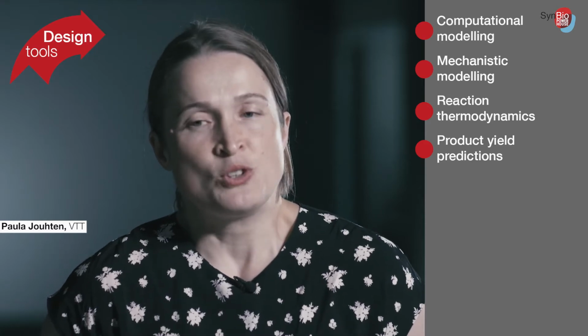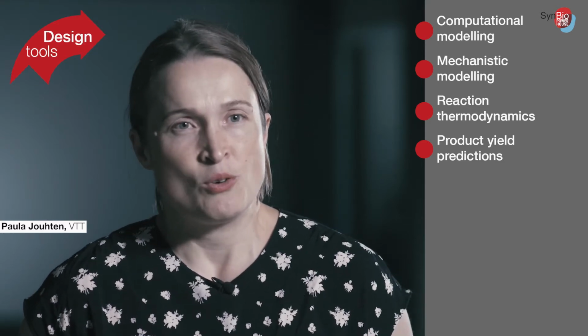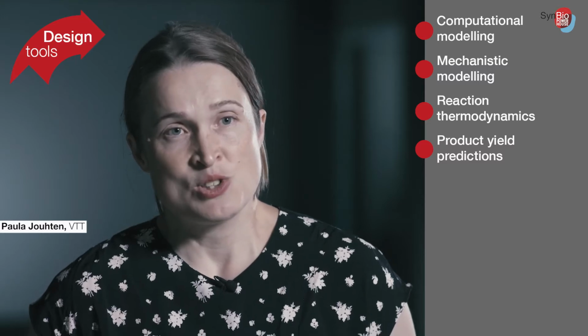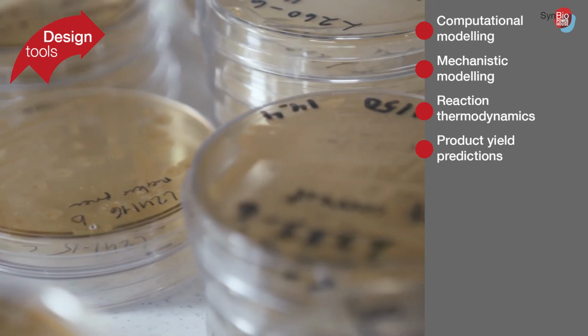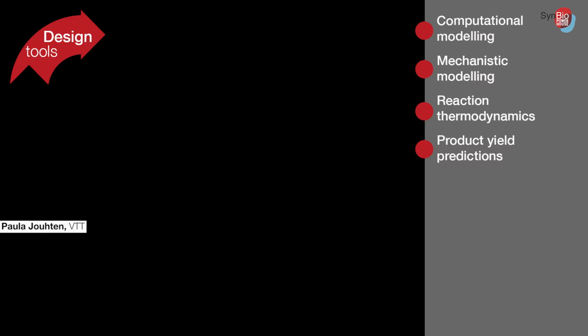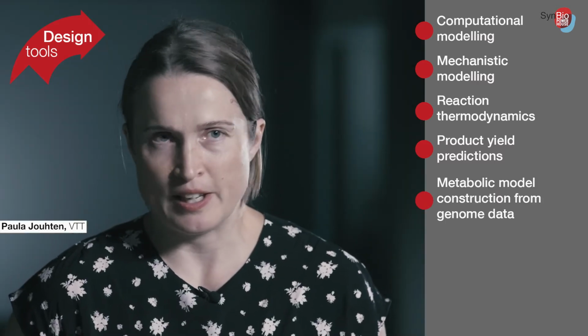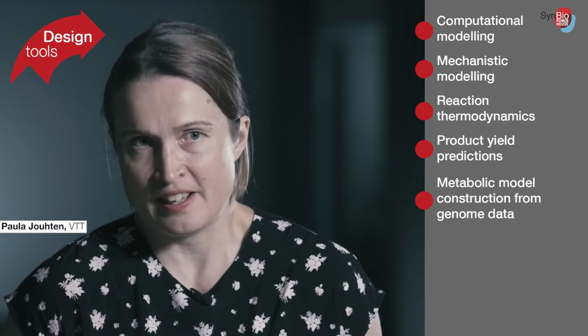So what should they contain? How efficiently should these reactions take place when they are metabolically active to meet our aims with the applications? This method is especially valuable when venturing beyond the well-known model host organisms, such as the yeast Saccharomyces or bacterium E. coli. For model organisms, there's a lot of accumulated knowledge, functional annotations, phenotypes recorded and such.